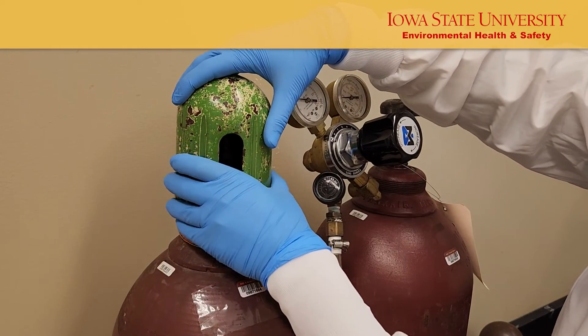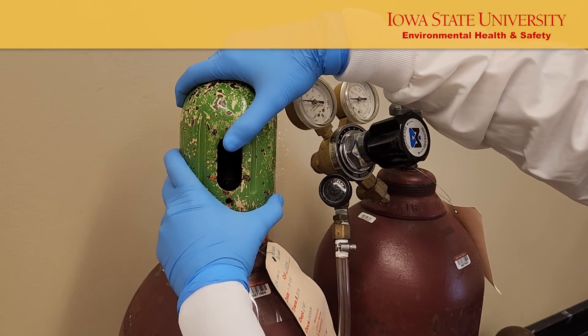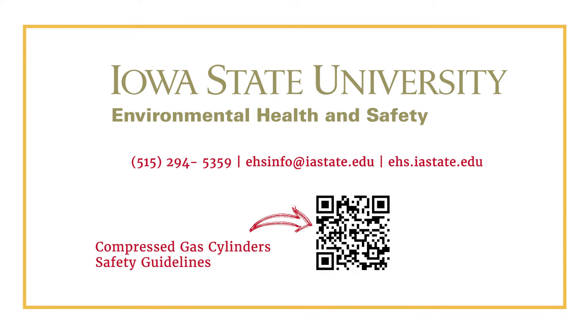After removing the regulator, replace the cap. The cap protects the valve while in storage and during transport. For more information about gas cylinders, check out the gas cylinder safety guidelines manual linked below.